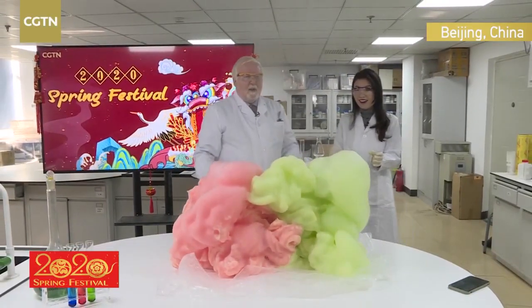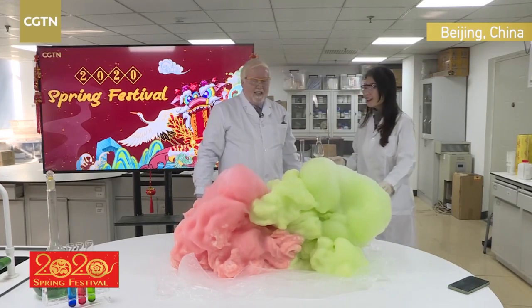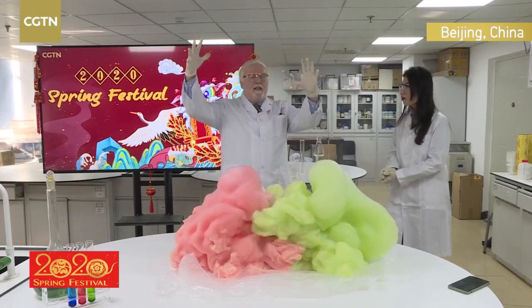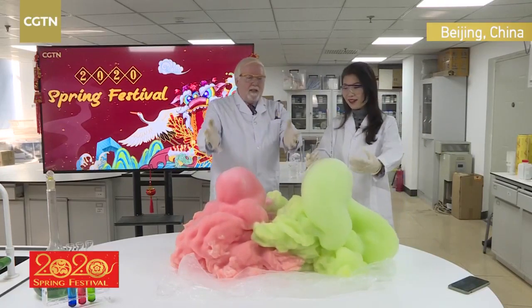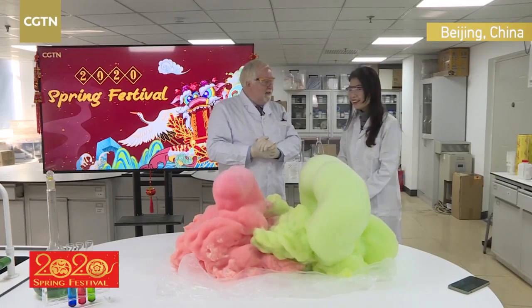Wow! So, no fire, but that's so fast. Indeed, I didn't imagine it this fast. Yeah, wow! So this time, it's just like the genie. It's blowing out large amounts of oxygen and steam. You can call this elephant's toothpaste. There's enough toothpaste there for several elephants.